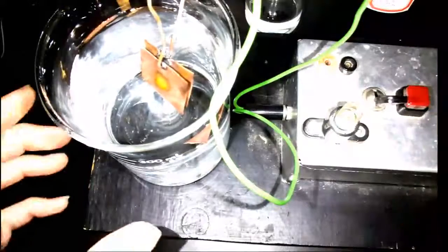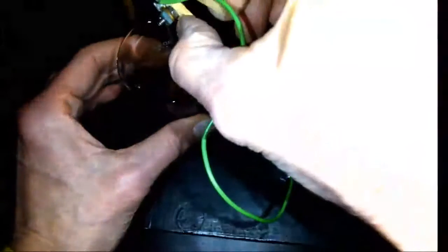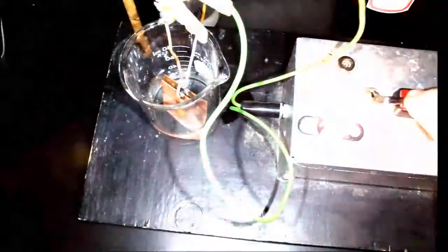Let's try it with some other solutions. Flip the switch back, lift up the electrodes. This is kind of a close quarters experiment, but bear with me. The first thing I'm going to test is sulfuric acid. This is 0.1 molar sulfuric acid in a beaker. I'm going to take off the extra moisture, and I will put the electrodes down into the solution at the bottom of the beaker. Now if we flip the switch and push the button, ta-da!